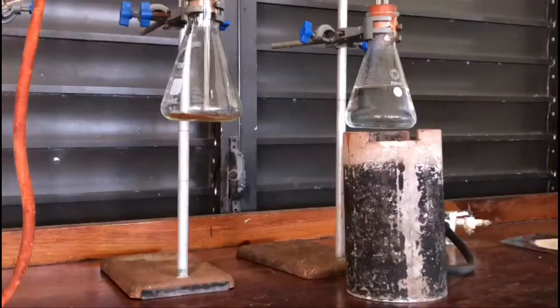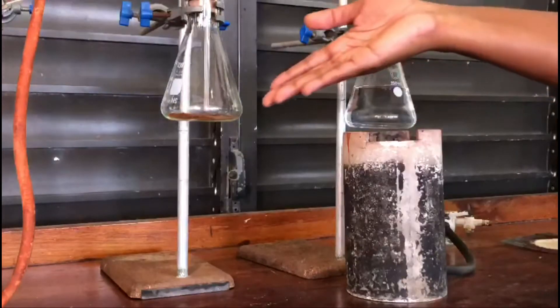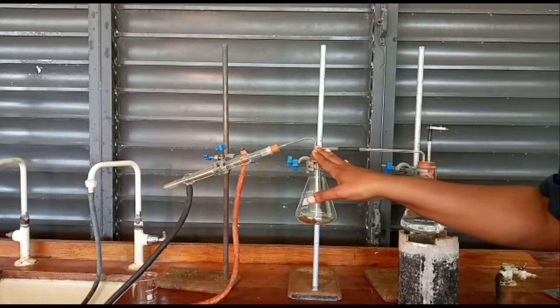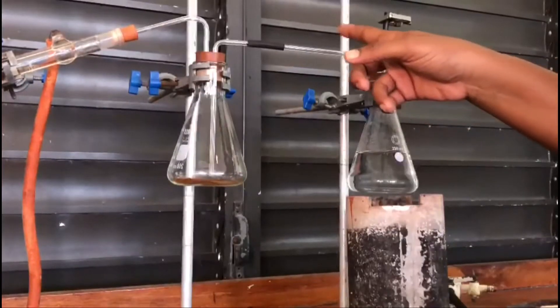Today we're looking at the distillation of clove powder. I have my conical flask with distilled water and my brown clove powder in this conical flask. The distilled water and clove powder flasks are connected by glass and rubber tubing. When I boil the water in this flask, steam will make its way through into this conical flask.